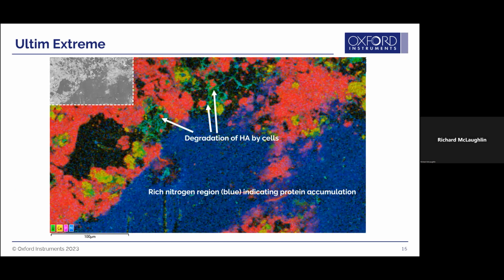So here's a map kind of showing what's possible. The dark blue area is plotting just nitrogen, and nitrogen is very difficult on a window detector because it's highly absorbed by the window. So having no window material in that extreme detector gives you a very intense nitrogen peak. So we get a very good indication of where this new cell growth is.